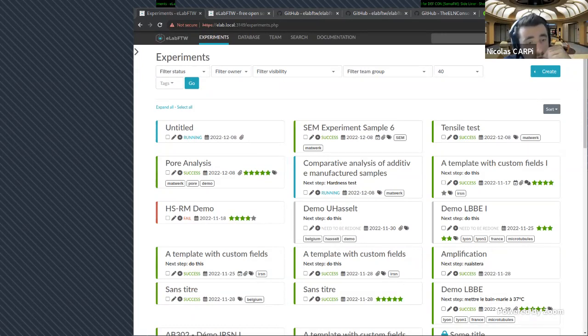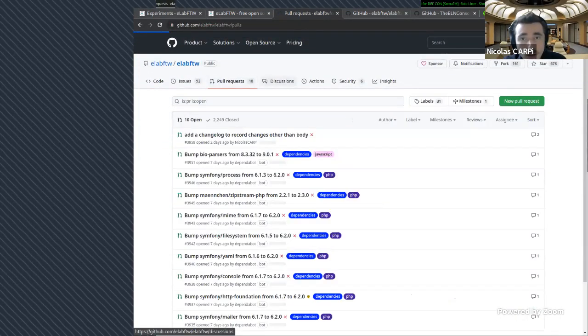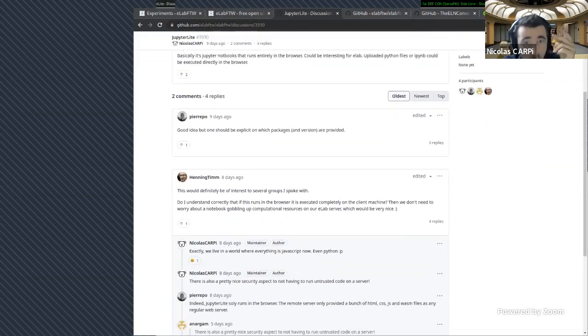So, Philippe, for JupyterHub: we had this discussion with the community about implementing JupyterLite, which is basically Jupyter in the browser.